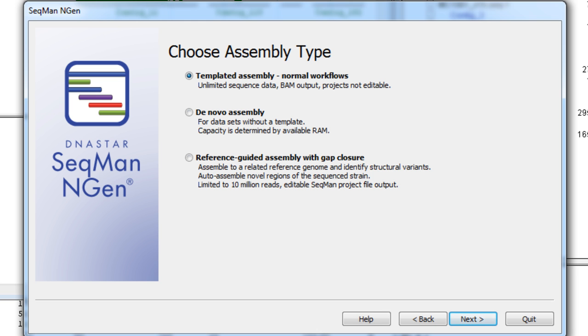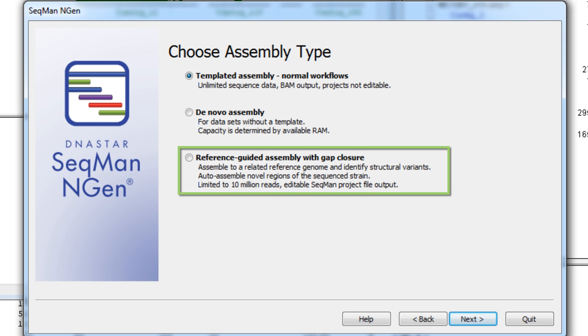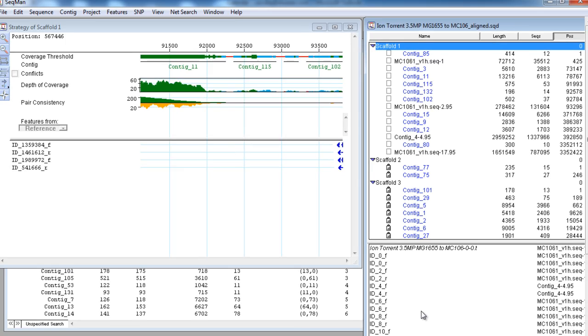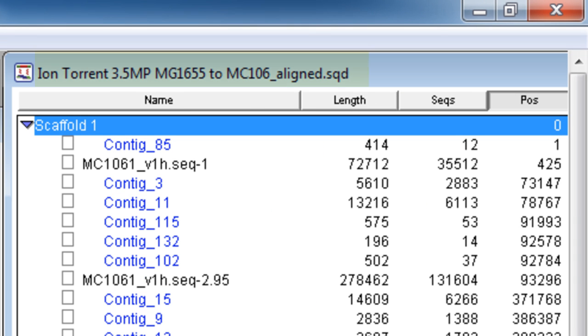For this particular example, we will use a reference-guided assembly with gap closure of E. coli strain MC1061. After the bacterial genome is assembled in SeekMan NGEN, we will want to open the most processed file in SeekMan Pro.